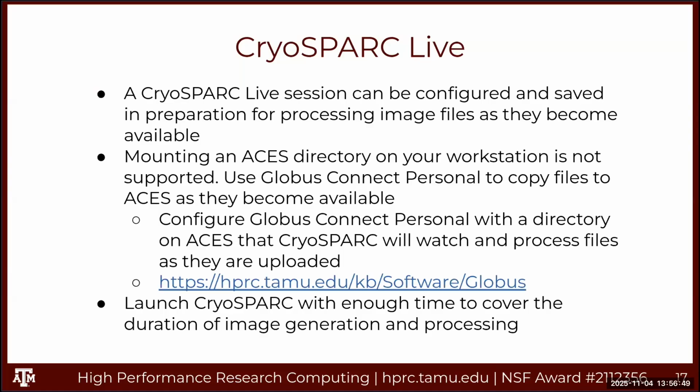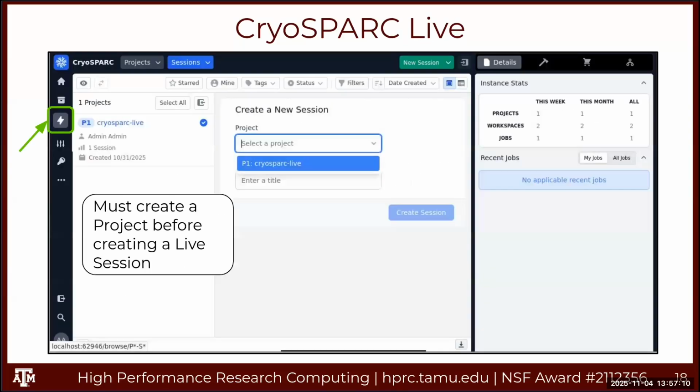And of course, you want to launch CryoSPARC with enough time. But in this case, you can pause the live session, and then you can end the session, or you can start it back up and continue your session again. If you're about to run out of time, you can cancel your job and launch a new job and start the session again, and it will start looking in that directory.